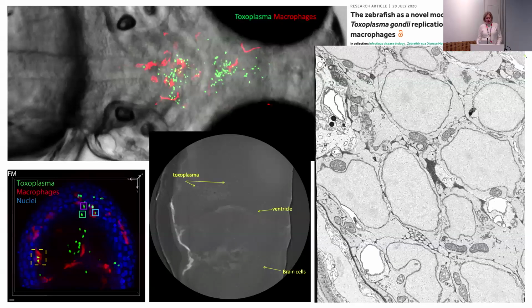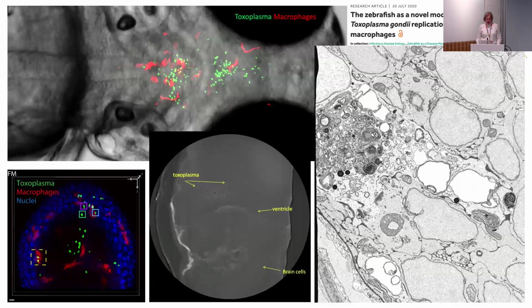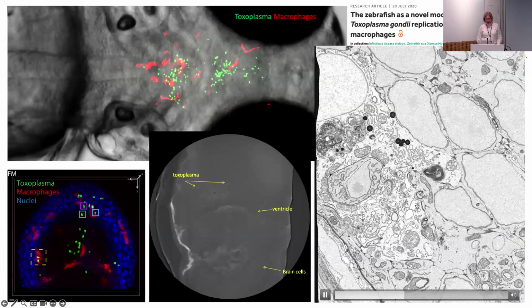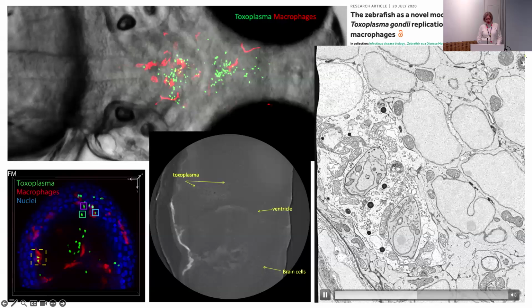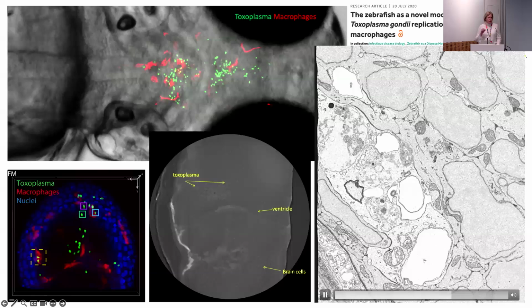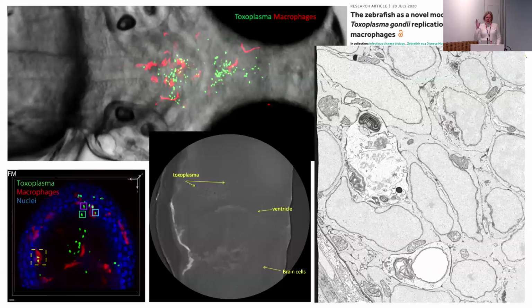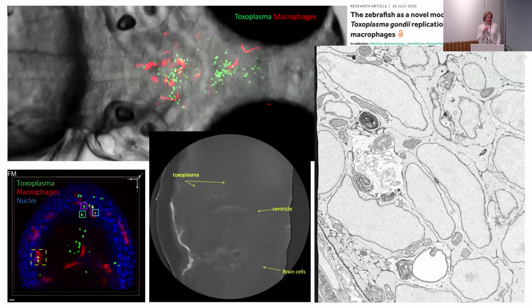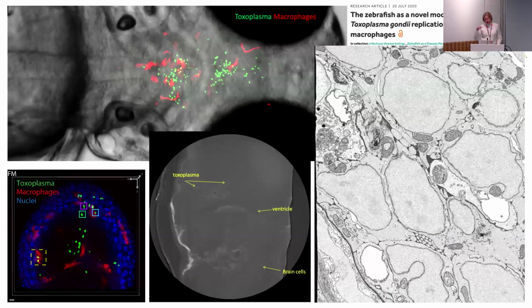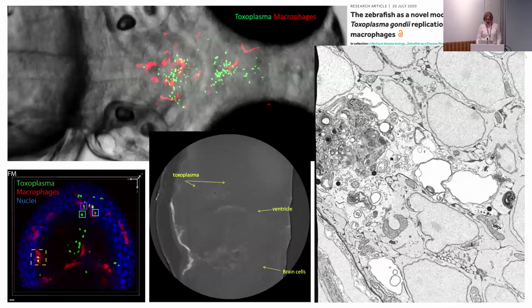And then actually serial section TEM, serial block face SEM, and focused ion beam SEM, which is what you're seeing here. And continuity is important here as well. So these are the 2 parasites. And the features the team were looking for were breaks in the host membrane that sits around the parasite, which indicates that the parasite is escaping from the cellular immune response, and also the mitochondria that are sitting around the vacuole.